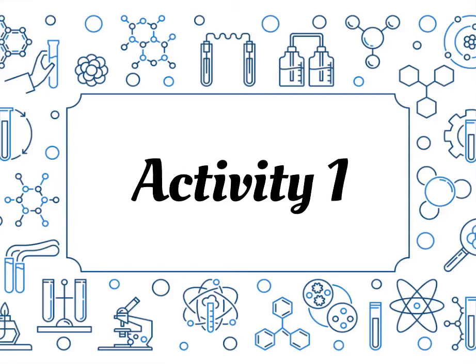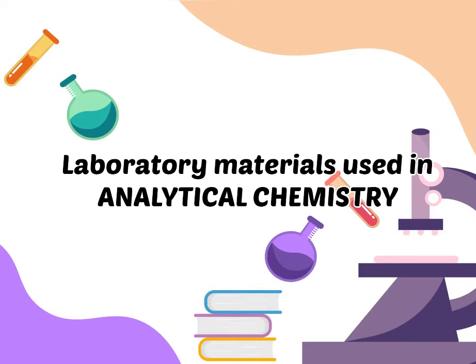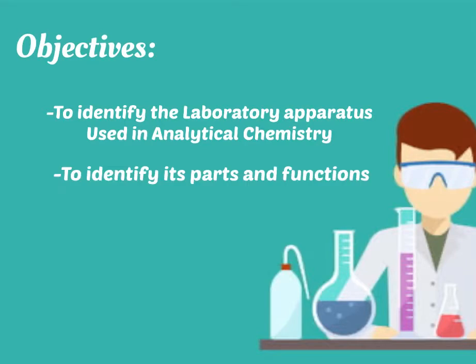Good day everyone, I'm Daño, and today I will discuss the laboratory materials used in analytical chemistry. Objectives: to identify the laboratory apparatus used in analytical chemistry and also to identify each part and its functions.